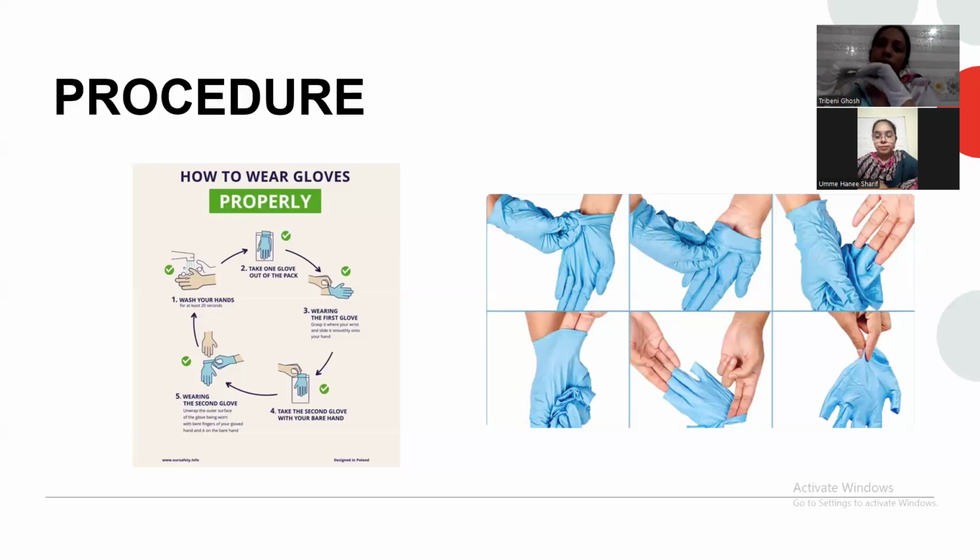Can you repeat it to me? Can you try yourself? First sanitize your hand. Oh, sorry. It's okay. Yes. Okay, then take your gloves and wear them. Actually, wearing gloves is pretty simple. During our work, we just have to make sure we choose the right gloves for ourselves.